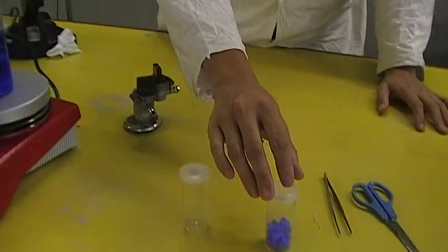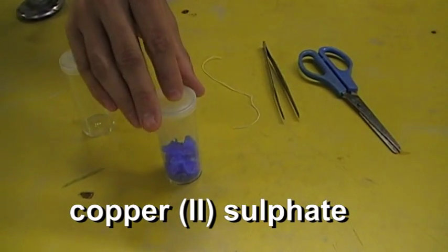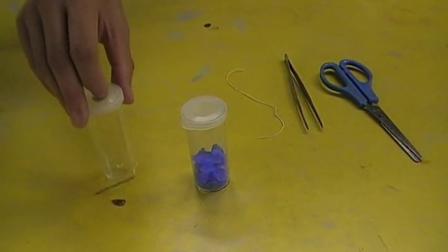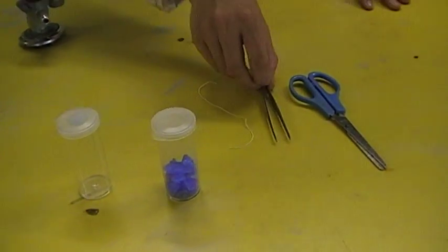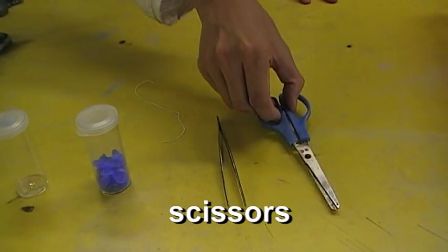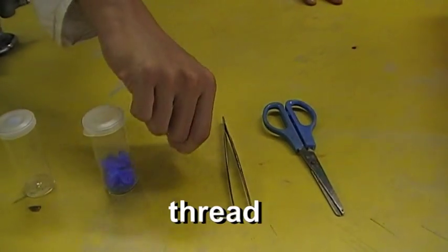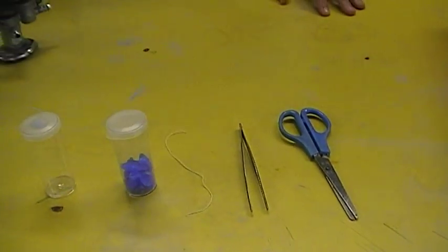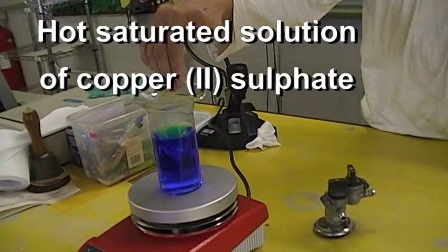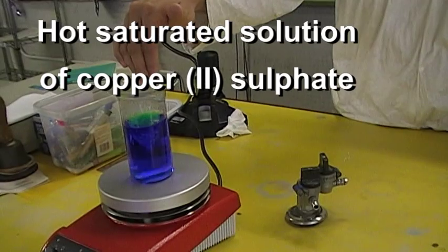There is a crystal of copper sulfate, a plastic bottle, a funnel stand, scissors, a thread, and also a hot saturated solution of copper sulfate.